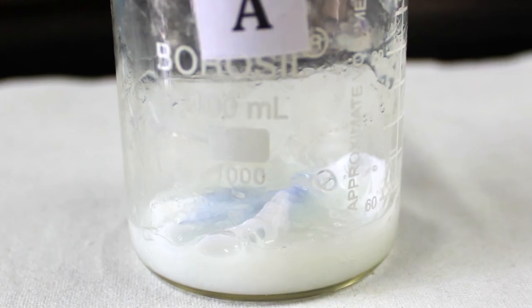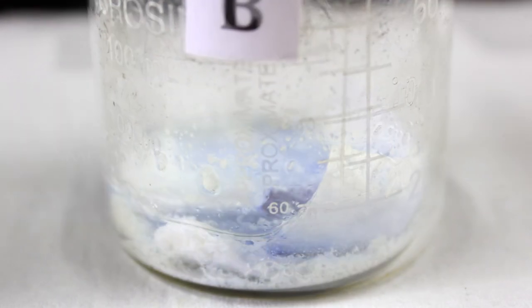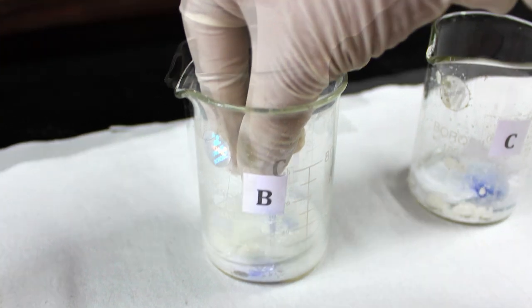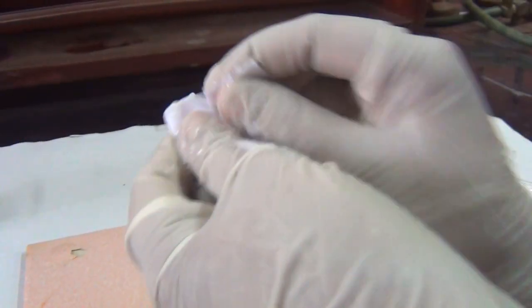Leave the three beakers undisturbed for about 10 minutes. Remove the piece of cloth from beaker A and rub the cloth piece. Take the other two cloth pieces from beakers B and C and repeat the same step.